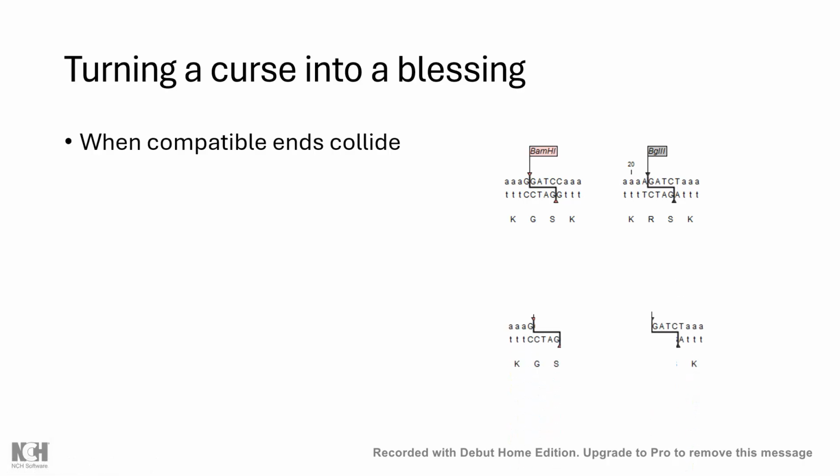You've got this lovely protrusion that would love to meet one another. And then when they get together, lo and behold, that ain't no BAM site, that ain't no Bagel site. It's none of the above. It's a chimera. So no subcloning for you. Perfect is what I say in this case, because what you've created is something that will laugh off BAM and Bagel, regardless of its parentage.